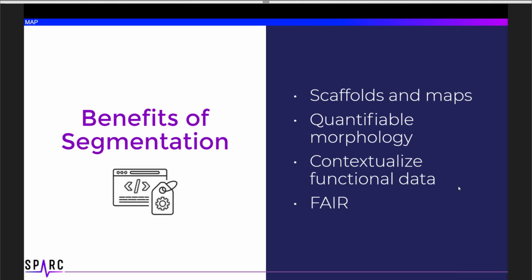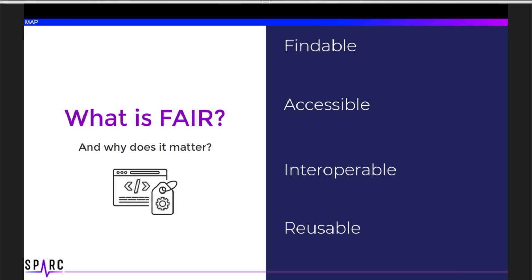We want to make sure that these microscopy segmentations have descriptive file-level metadata. This metadata provides a sufficient explanation of what the data is and where it came from and how it was created. Through the novel integration in MBF Bioscience software that we're going to talk about today, you can add this metadata to segmentation files at the time of data creation or to existing files. By enriching this metadata, we can contextualize the data and make it findable, accessible, interoperable, and reusable, or FAIR.